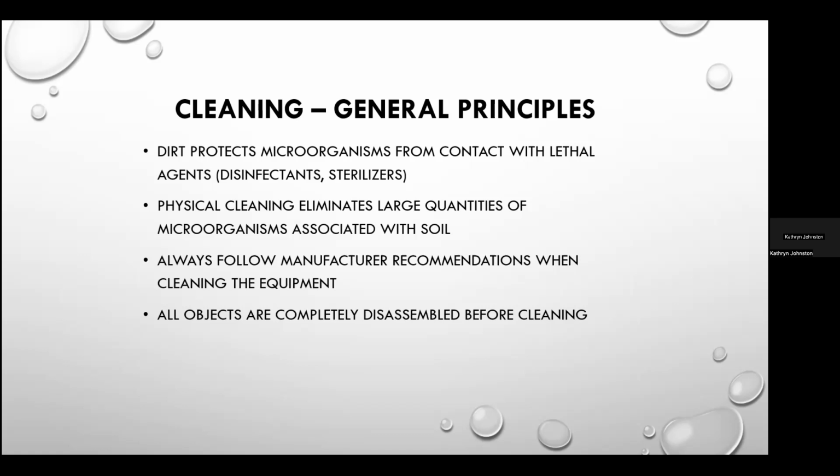And some chemicals used for reprocessing devices are inactivated in the presence of organic material. So it's really important that whenever agents are being used in the laboratory, you have appropriate counsel on which to use in which situation. So infection control should be able to give you guidance on the selection of not only cleaning agents, but also disinfectants.